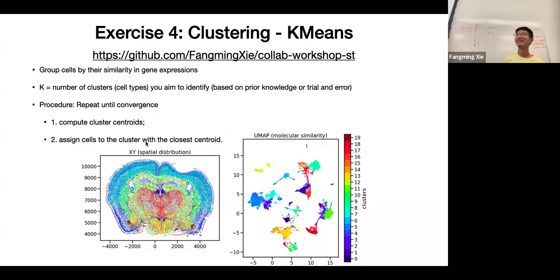Another one, maybe July. Oh, 7. So let's start from -7, because there's no negative. I guess you can start up there, but it takes more iterations. But just to see.